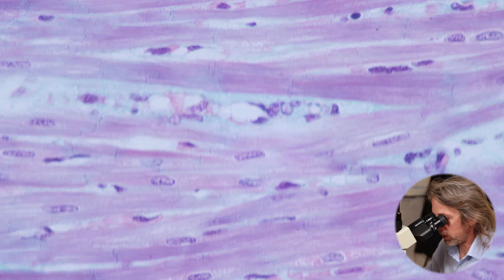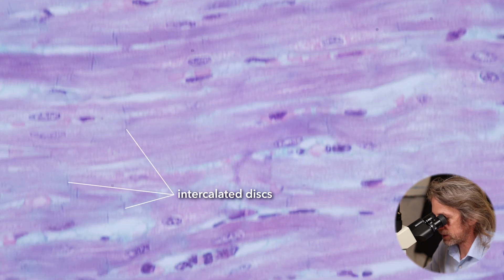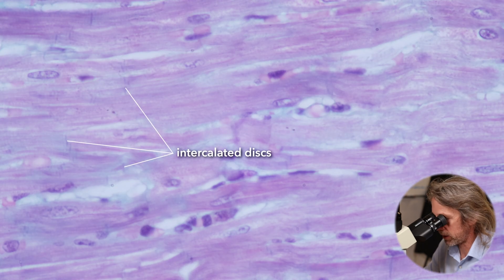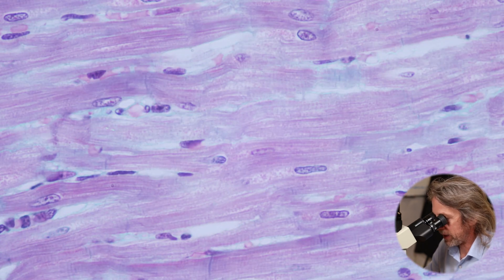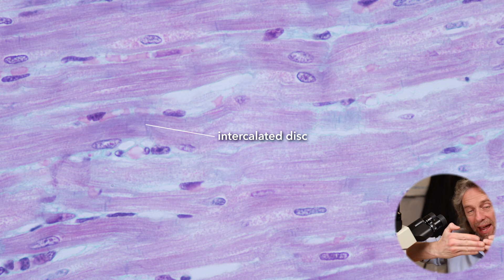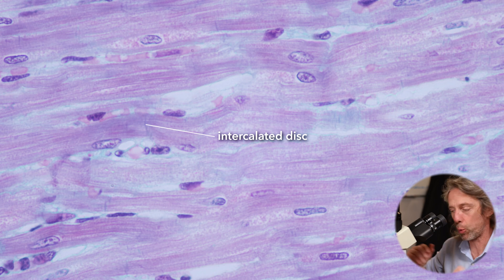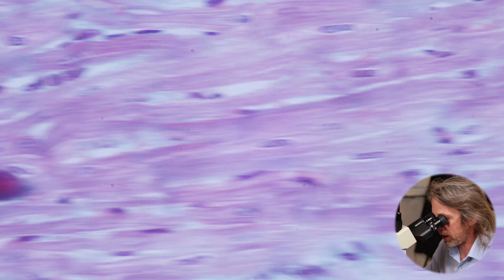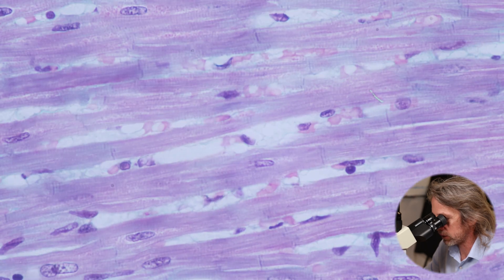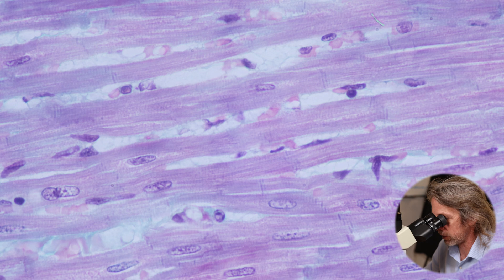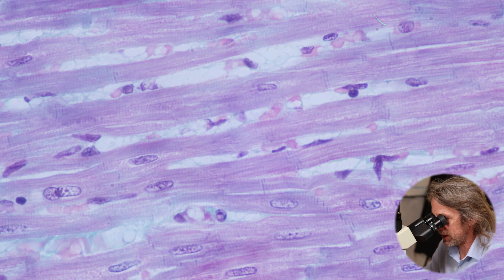The other key feature to look for are intercalated discs. I can see that dark mark in the middle — the intercalated disc marks where one cardiomyocyte ends and the next cardiomyocyte begins. It's a join between two neighboring cardiomyocytes. So we don't have very long cells as with skeletal muscle; we have shorter cells joined together by these intercalated discs.